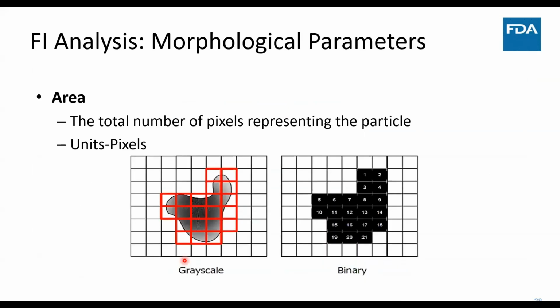The first parameter that is calculated is the area. This is what most of our parameters are based on, even the size. This is done by what is called a threshold, right? You have a grayscale where it looks at pixels or areas where there's a minimum threshold of grayscale we're looking at. So long as a pixel is above that expected grayscale, we count that pixel as part of our area. So these are binary scale areas or pixels, with or without part of the object.